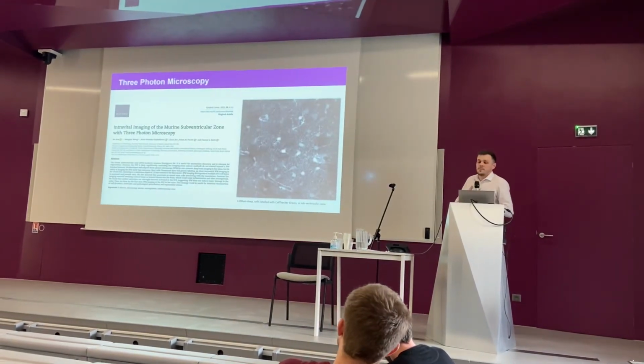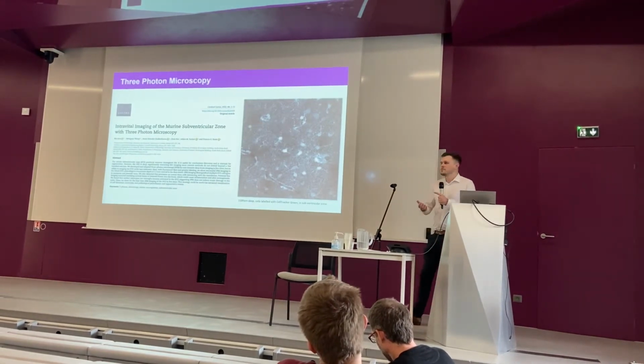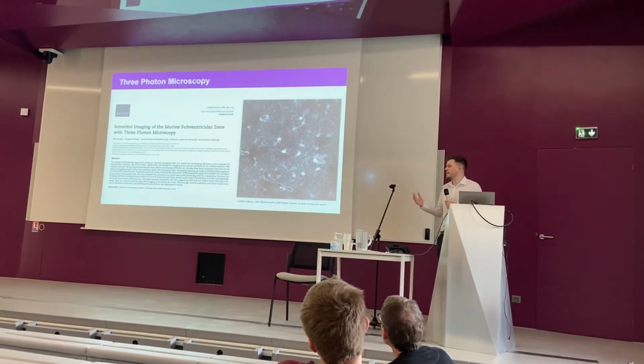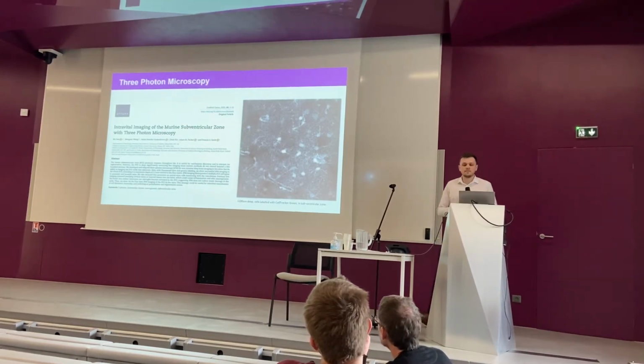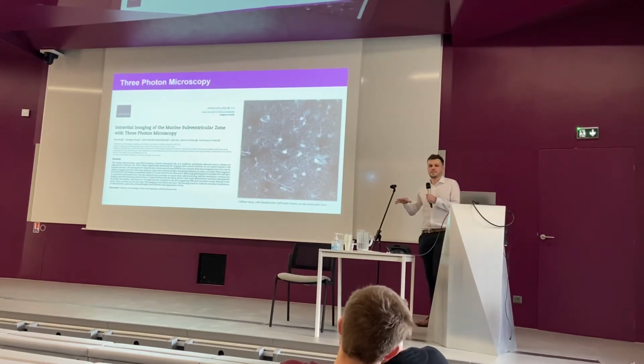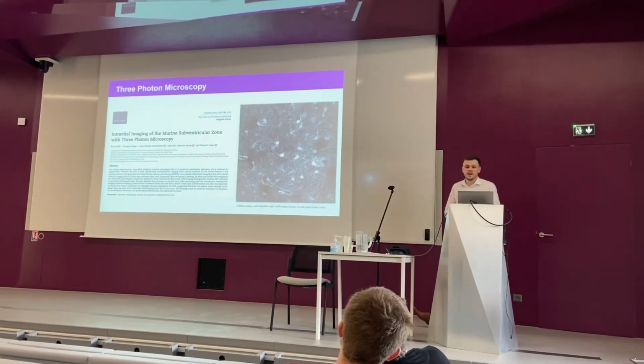I've recently personally been working with a number of 3P systems spread around, say, Zurich, Imperial College London, the University of Oxford, and Freiburg in Germany. Our aim is to make 3P as accessible as 2P is now. And we're really there, the technique's really ready for prime time.